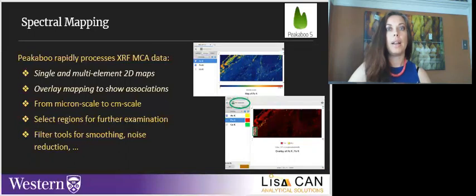In addition, you can highlight a region on a map for further spectral processing. In the bottom example, I'm highlighting a region. By selecting the plot, Peakaboo will then take you back to the fitting window to re-examine the XRF spectra.